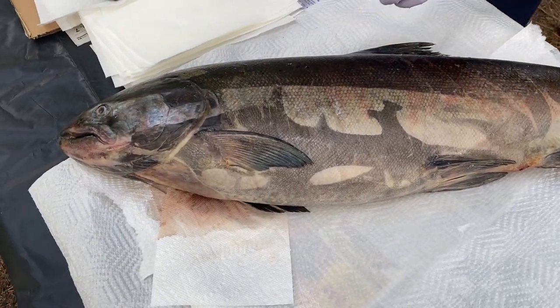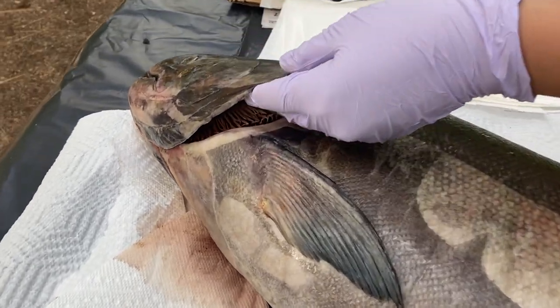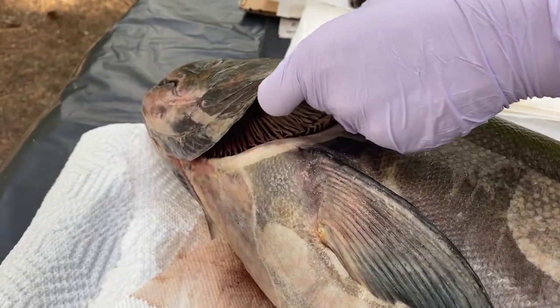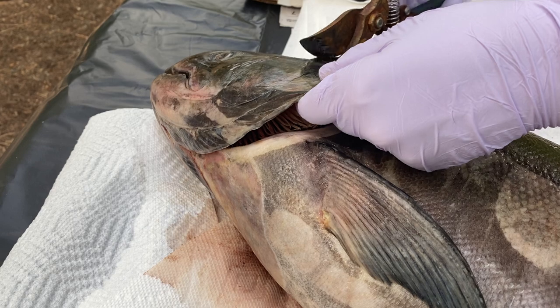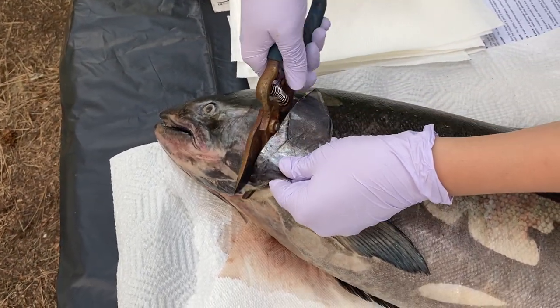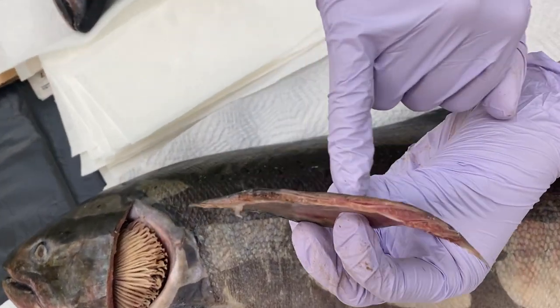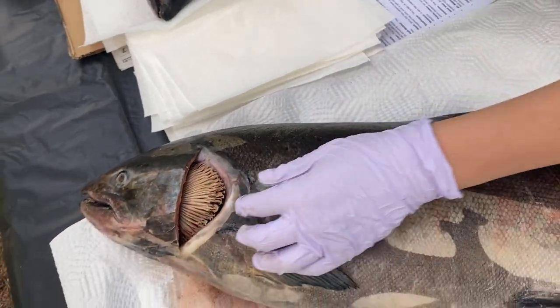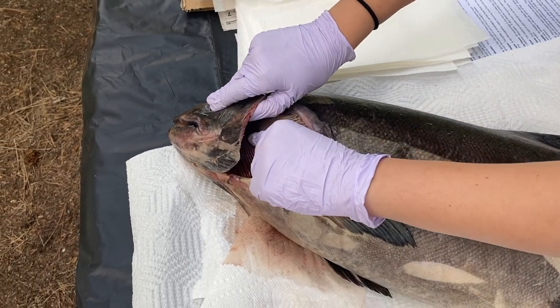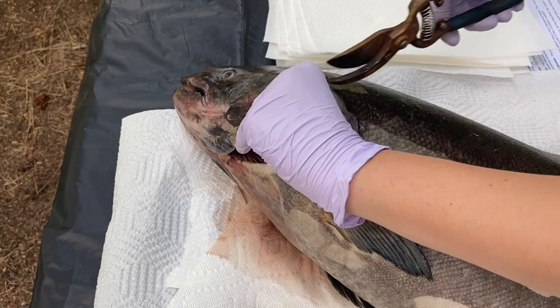And then I guess we can explore the operculum and the gill cover a little bit more. So what I am going to do is cut the operculum off. We can see that it's just a thick bony structure. So we'll set that there. And then we can see the gills a little bit better here. And I'm going to cut out one set of gills and explain how these work.